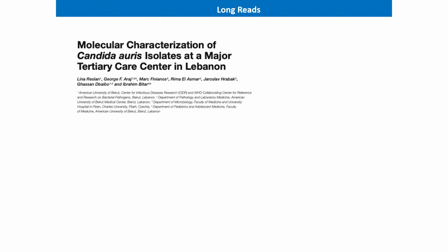So I introduced the Sequel 1 seven years ago, and it stayed 7 years in my lab, and we published more than 60 publications during these 7 years. Many genomes have been deposited in the NCBI database. I'm going to talk about one particular project because I needed to sell my kidney to pay for the sequencing on Sequel at that time.